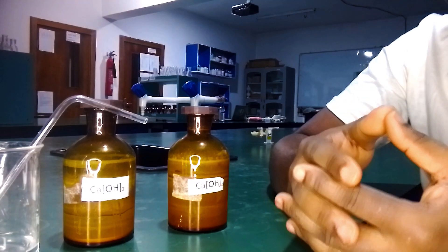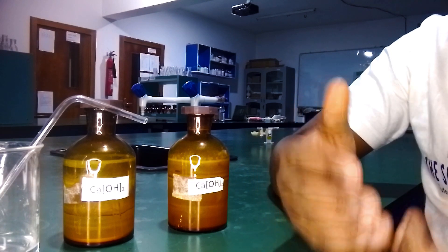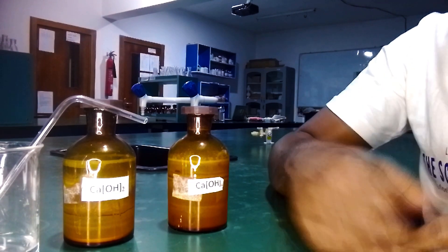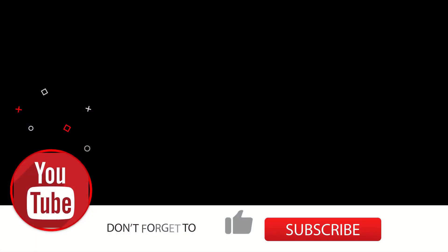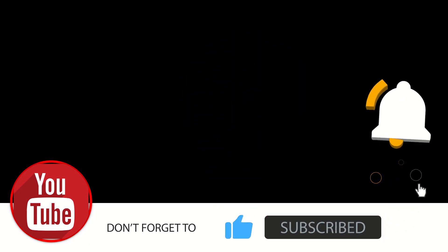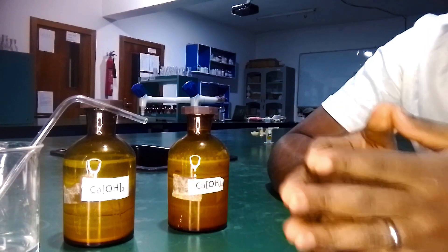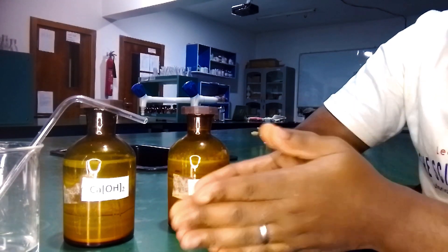We are going to use the natural method to get carbon dioxide in this experiment, which is your breath. You know that the air we breathe in contains oxygen, carbon dioxide, and nitrogen, but we take in oxygen and breathe out carbon dioxide. From this experiment we are going to confirm that the air we breathe out contains carbon dioxide, and also that carbon dioxide reacts with lime water to turn it milky.